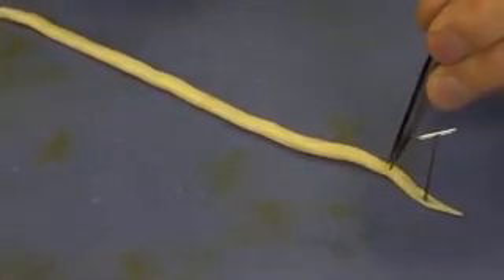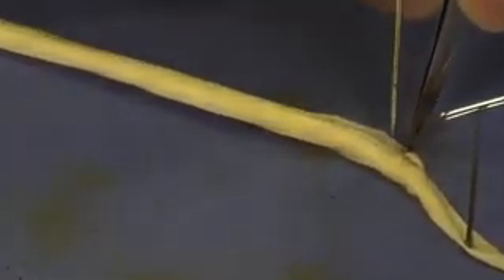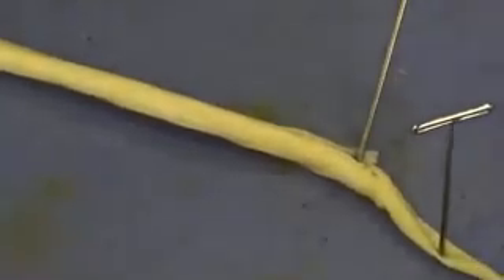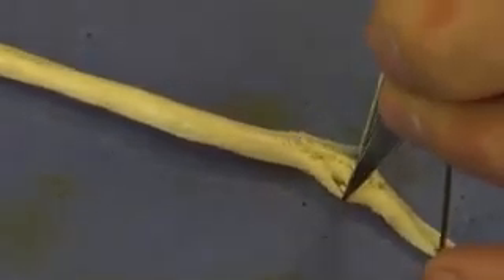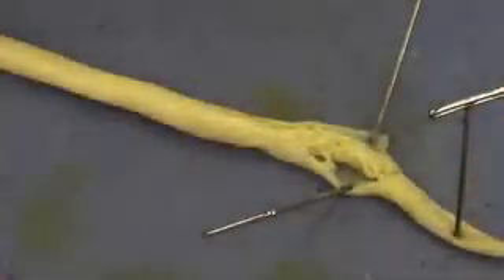Now the skin of the roundworm is very thin and delicate. They actually breathe through their skin in a process called cutaneous respiration, so their skin needs to be very thin and moist for this to occur.